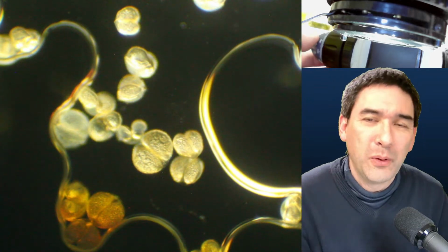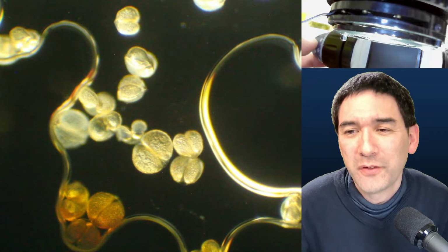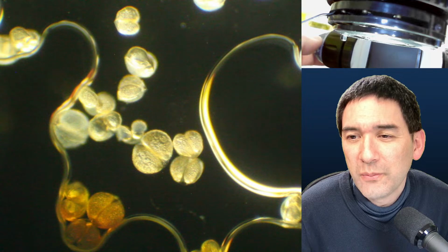If you look at the pollen, you see that there's a little bit of surface texture, which maybe is a little bit better visible over here. Yeah? I would like to fixate some crystals. What should I use to make a permanent slide? The urine crystals disappear again, maybe because of the water in the air.